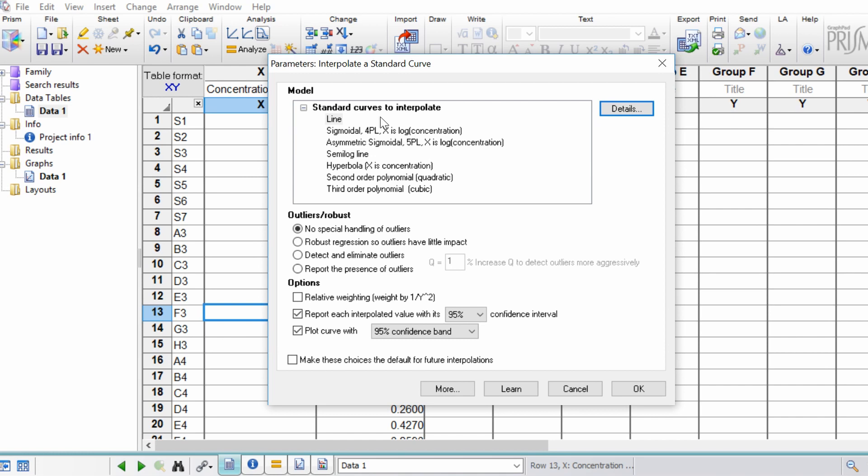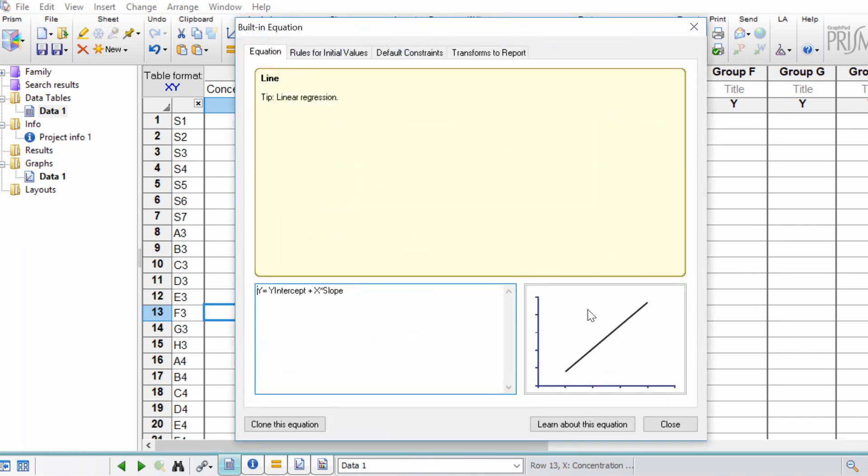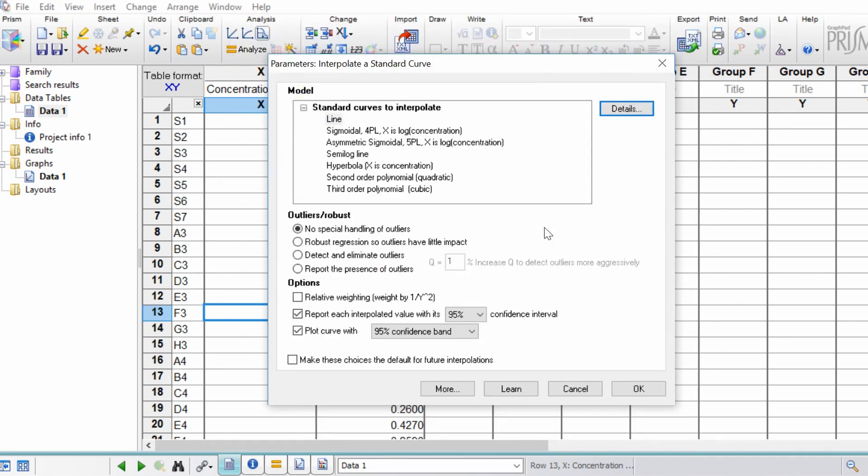If you're not sure about the patterns of each of these, what you can do is select one and then click the details button. This will open up a representation of what the relationship should look like. This case is a linear curve. Now, I know for my example mine curves, so it's not necessarily a straight line.